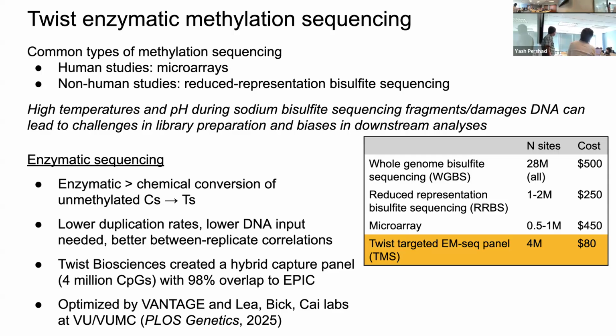So for the EPIC version, they have a lot of replication probes to make sure they have measured accurately. So does the Twist deal with that? Do they use the reverse strand or forward strand? Yeah, this is paired sequencing. So it's pretty, we've observed that it's very robust, and even at low coverage, I'm happy to show some stats on that later.